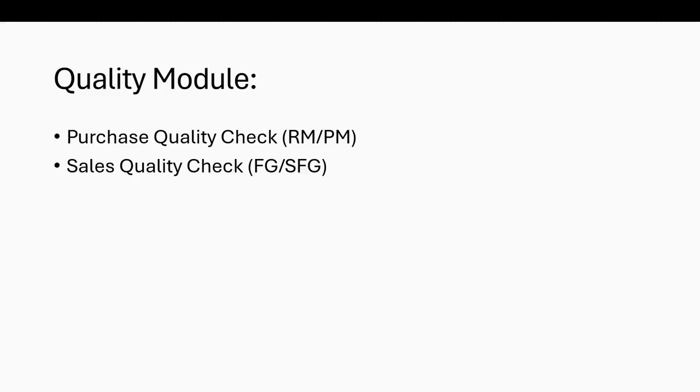Hi, in this demo, I'll walk you through the quality process in our Pharma module, which we have built on top of Microsoft Dynamics 365 Business Central. I'll cover the purchase quality check of raw material and packing material that we procure, and the sales quality check of finished goods and semi-finished goods that we produce.